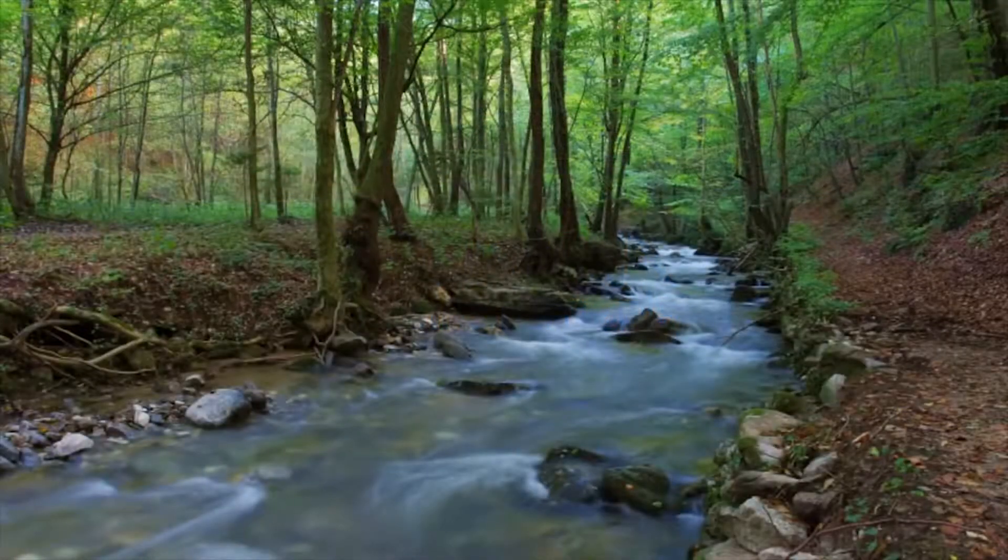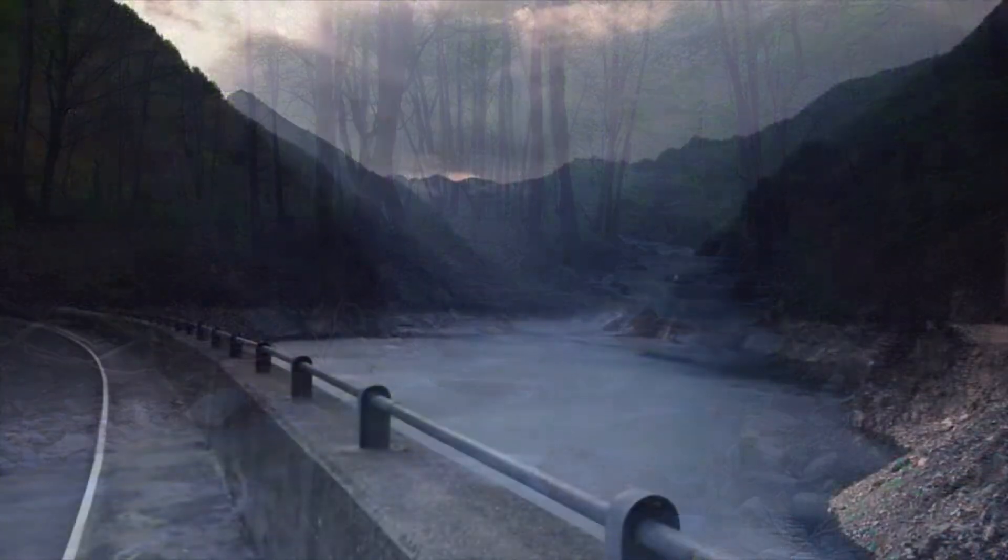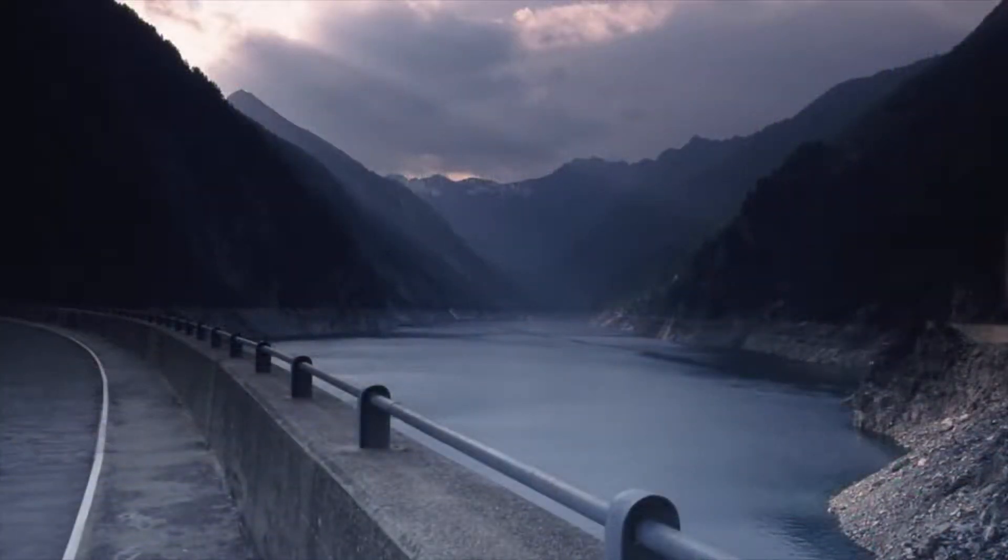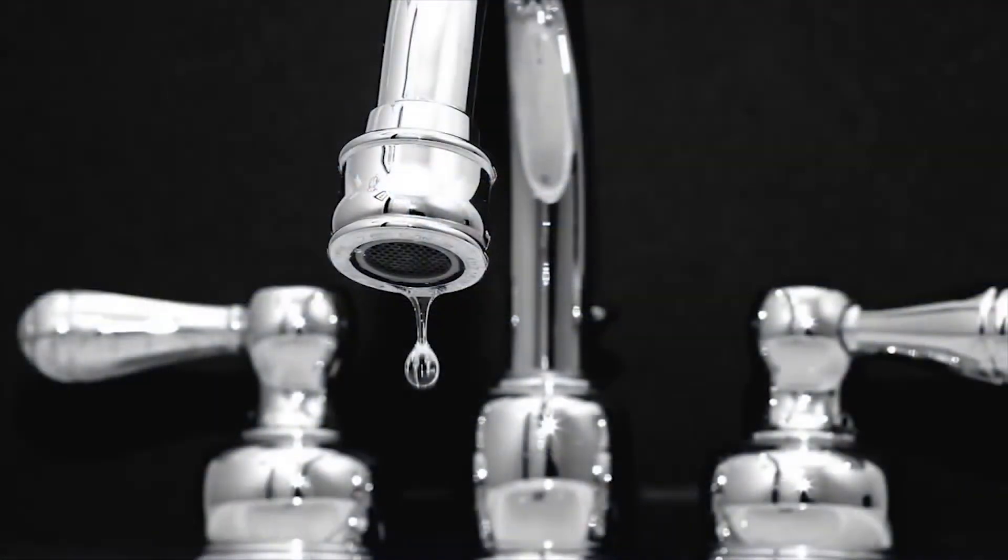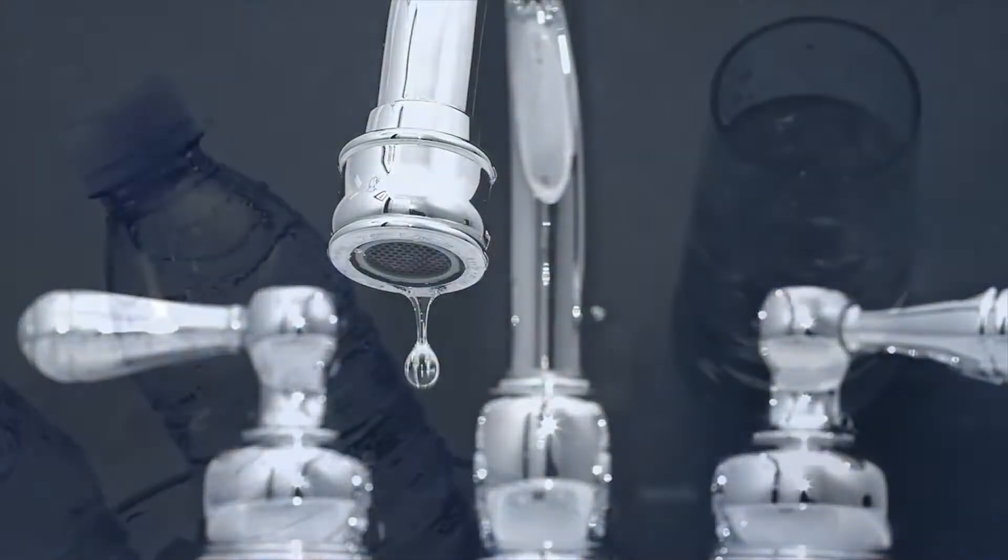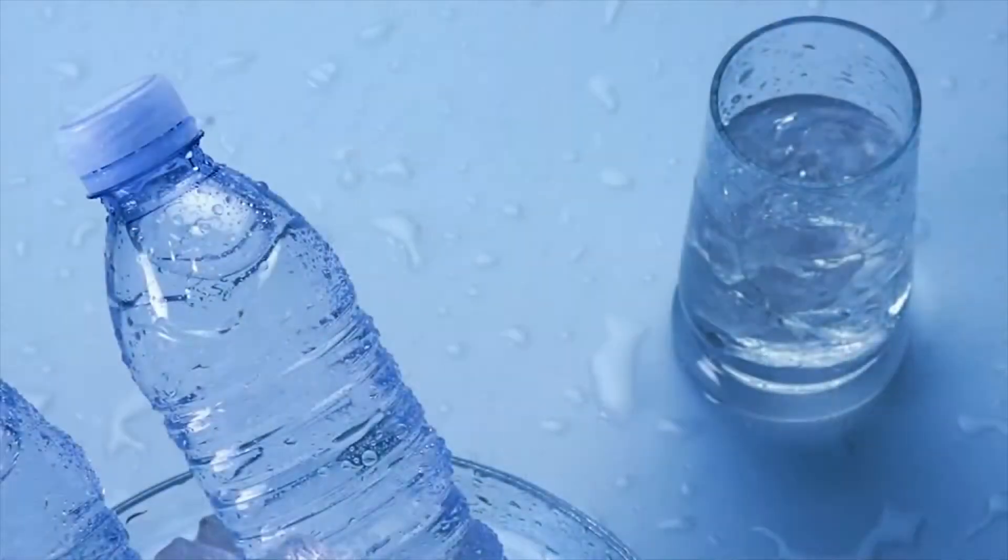Water. From the ecological habitats of our oceans, rivers, and lakes to agriculture and drinking water, it's an essential component of life.